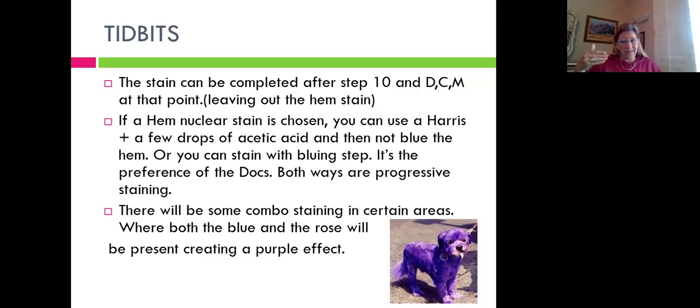The reality check, though, is that most of your manufactured hematoxylins already have acetic acid in them. So you really don't have to worry about it. It's kind of one of those Carson's throwing you for a loop type thing. But just know that that's why she's saying acetic acid.